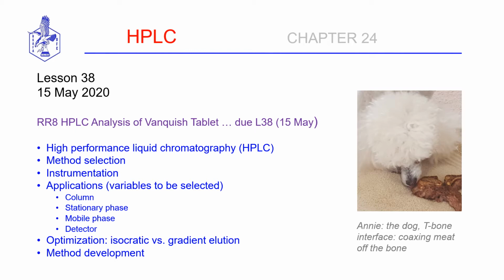The big advantage to gas chromatography as opposed to liquid chromatography is in regard to the mobile phase. With gas chromatography, we simply choose an inert gas, usually helium. When we do LC, there is a much broader variety of mobile phases that we need to consider in terms of their relative polarity, and we will get into the details of this later.